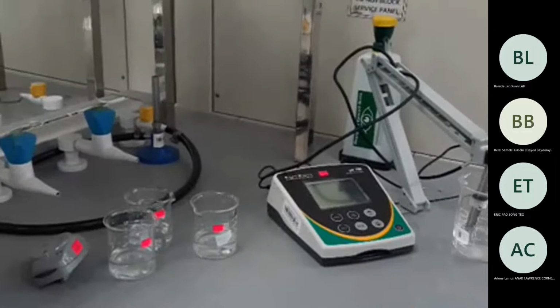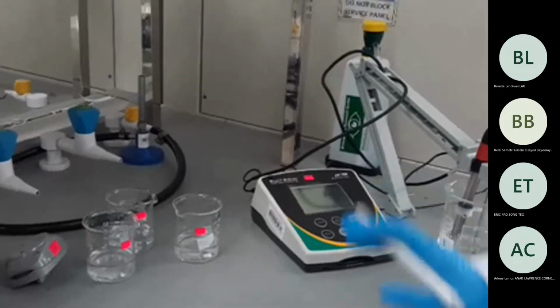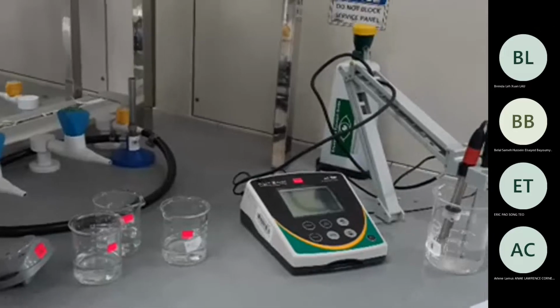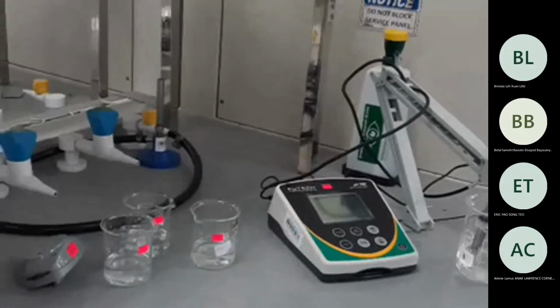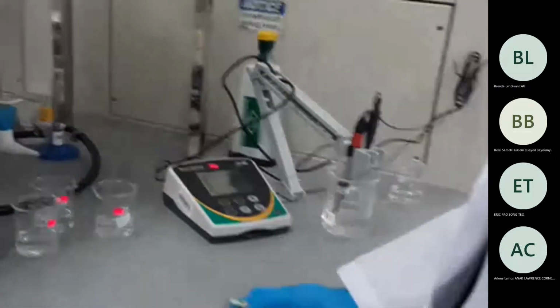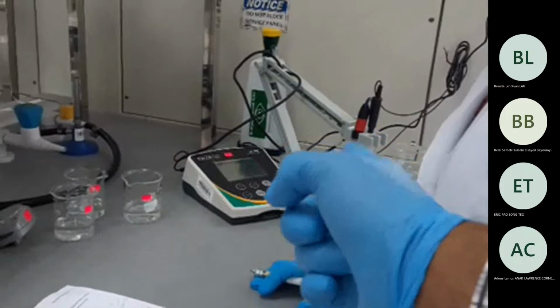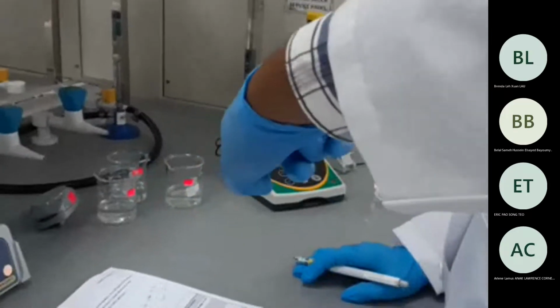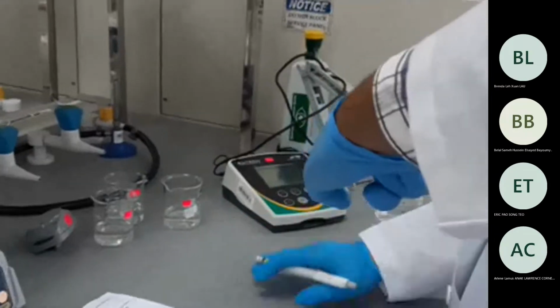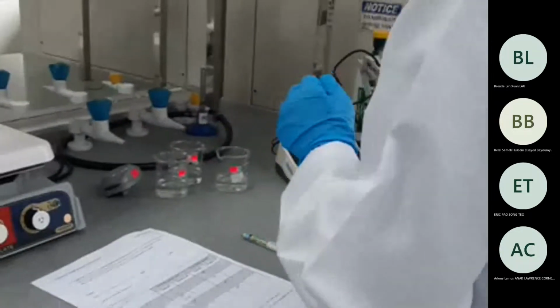In one beaker, we add 0.1 molar HCl, see how the pH increases or decreases. In another beaker, take 25 milliliters and add 0.1 molar sodium hydroxide, see how it changes. We'll be dividing this 100 milliliters into 4 different beakers, so you have to have 4 beakers. By the time it gets ready, you can prepare 4 beakers, 1, 2, 3, 4.